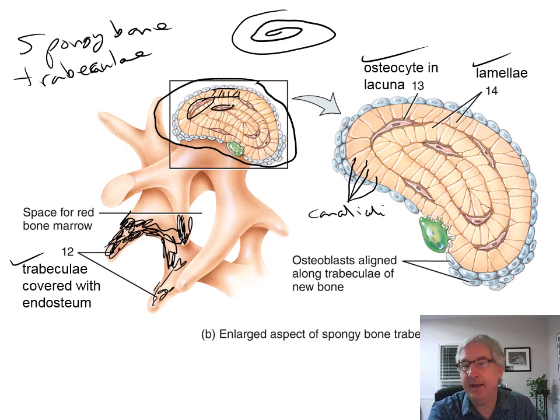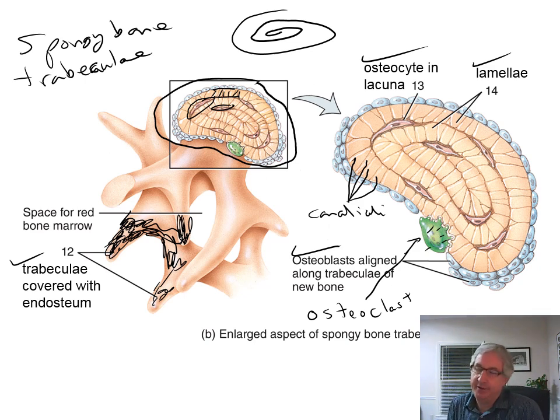There, and so here's an osteocyte in a lacuna, and on the outside here, these are osteoblasts, and then you have this big fatty guy here. This is an osteoclast, the green guy there. You notice he's got these little tiny dots in the middle of him. So you see that there, and there. Osteoclast is multinucleate, has multiple nuclei in it, so it's a larger cell. And the osteoblasts are more normal. They have a single nucleus in each one of those.